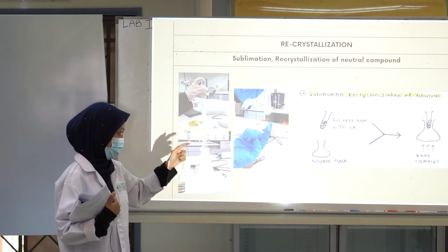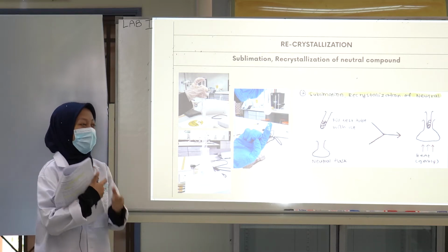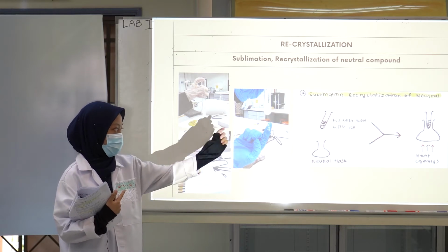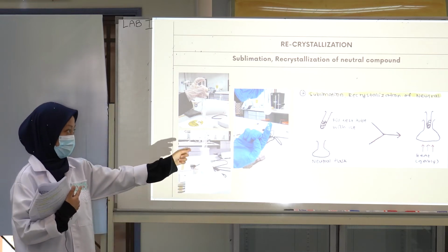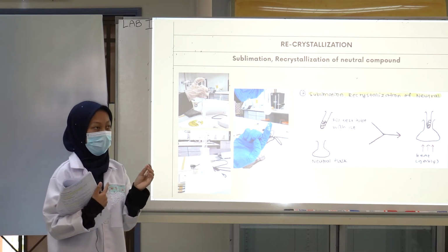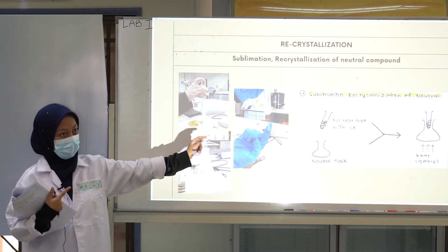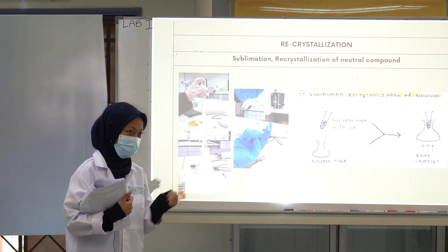After we fill the test tube with ice, we can see the water condense, right? So we need to always wipe the condensation. Because if we want to do the next stage, the condensation that appears may wash the crystal away, the white crystal that occurs after we heat the flask. So that's why we need to always wipe the condensation.